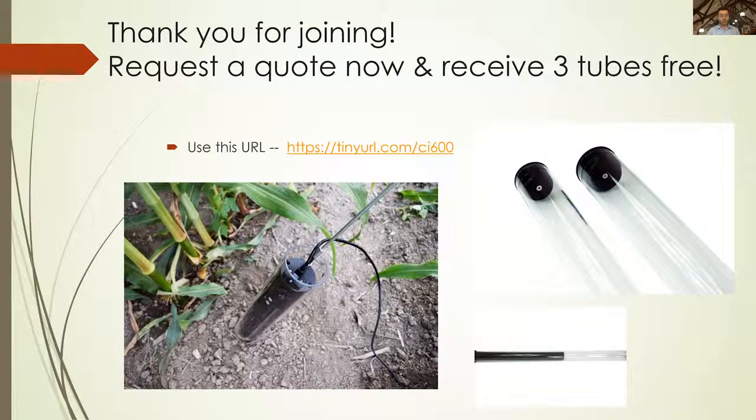So the next question is, again, how big of an area can be measured? That is simply the scanner head and dimensions. So you have 34.3 centimeters of the scanner head. You can scan that and just keep doing that for, like, 6 centimeters diameter all the way through. And you can do, I would say, 2 meters very comfortably. And I've known some researchers to do more.